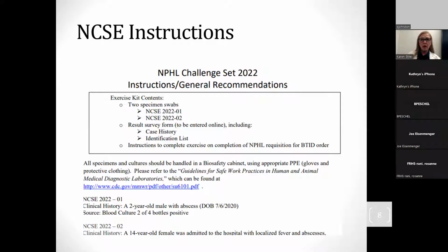MPHL is going to offer a number of laboratories, we're going to see how many we can support for free. So I would like to see if you are interested, and I'll probably contact you all after this for a sign up on that class. It's just an hour plus, because there are a couple of exams involved to cover the competency part. So we definitely need to know how to work with the biosafety cabinet in real life.